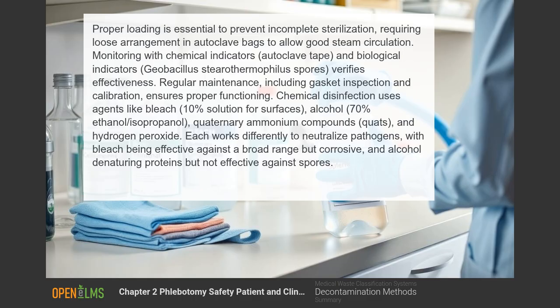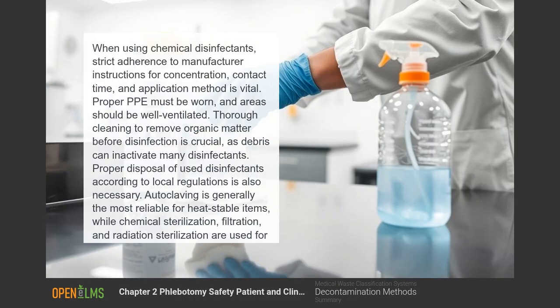Chemical disinfection uses agents like bleach, 10% solution for surfaces, alcohol, 70% ethanol, isopropanol, quaternary. When using chemical disinfectants, strict adherence to manufacturer instructions for concentration, contact time, and application method is vital.